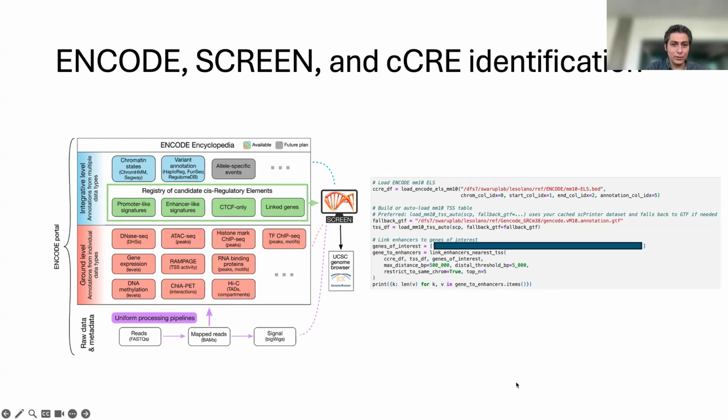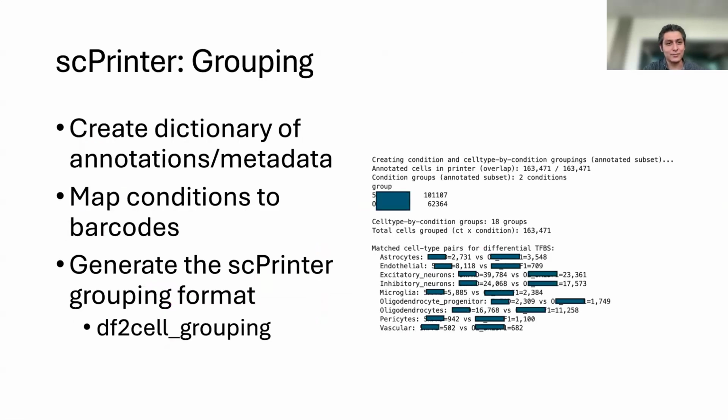And then this will let us get at enhancers that are already known, already documented, and essentially orthogonally verified by ENCODE, or at least orthogonally proposed by ENCODE. So this has been the approach that I've been taking to my own enhancer identification, or proposed enhancer identification.